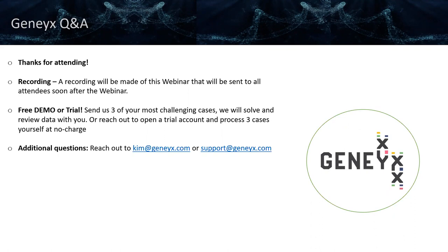Okay, the second one that came in: can data be shared across different labs that use Geneyx? Yes, it depends on how your license is set up, but the Geneyx Analysis platform does support inter-lab sharing. Basically, if you provide access to other labs, they'll have access to your frequencies, your variants, your annotation sources. So the answer is yes, we would just have to set that up on your license.